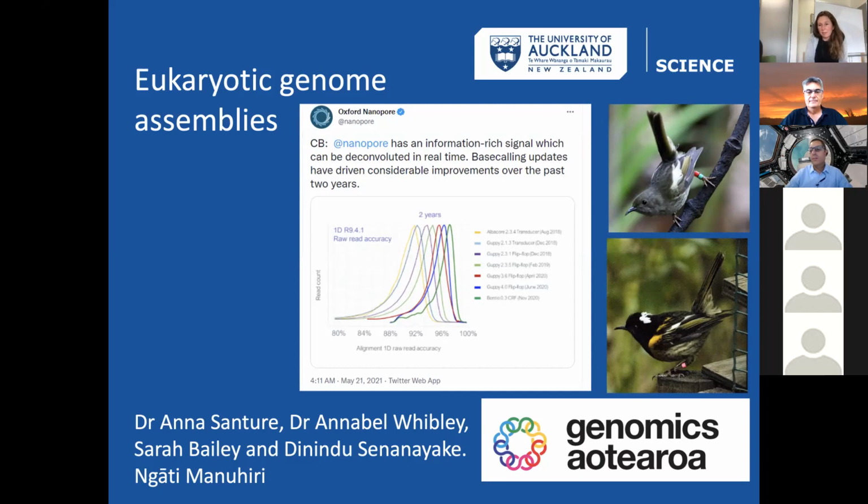And I like to talk about this because we live these improvements. They kept releasing new versions of Guppy or new chemistries, and it made a material improvement to our assembly. So I was working on the HeHe, and we've recalled base data and assembled that probably 4 times in the course of a 2-year COVID disrupted project. And I also want to say, if you have experiences with this technology from a few years back, and maybe the performance of the product or the accuracy were an issue for you, you should look again, because it's really quite incredible how much the progression has been.